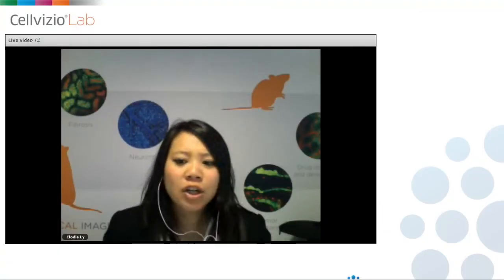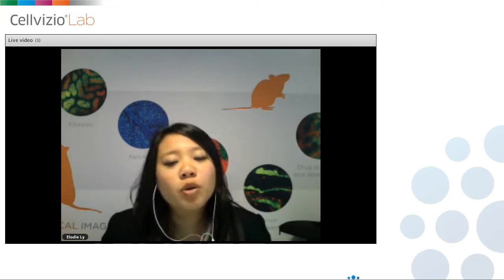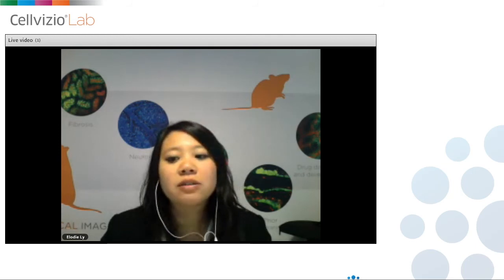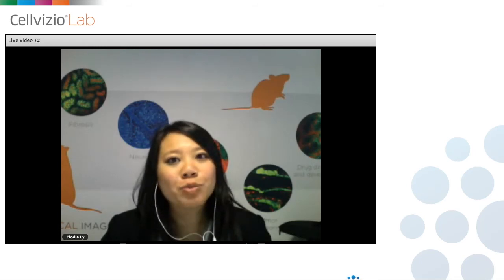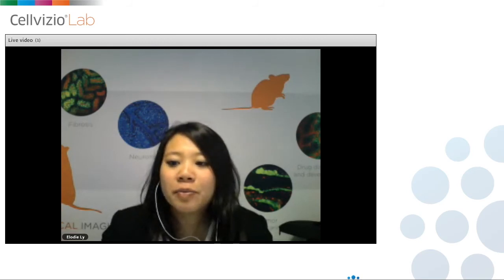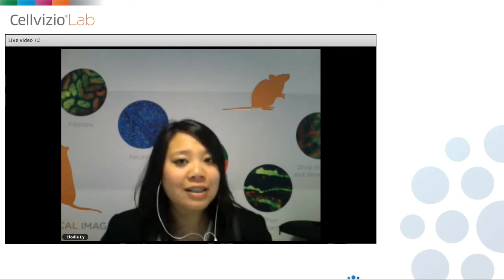I have another question regarding the type of fluorophores that we can use to look at vasculature. I have given some examples during the presentation. You can use, for example, dextran, a biopolymer for which you can select the size, and you can link it to FITC, which will fluoresce with the 488 line.